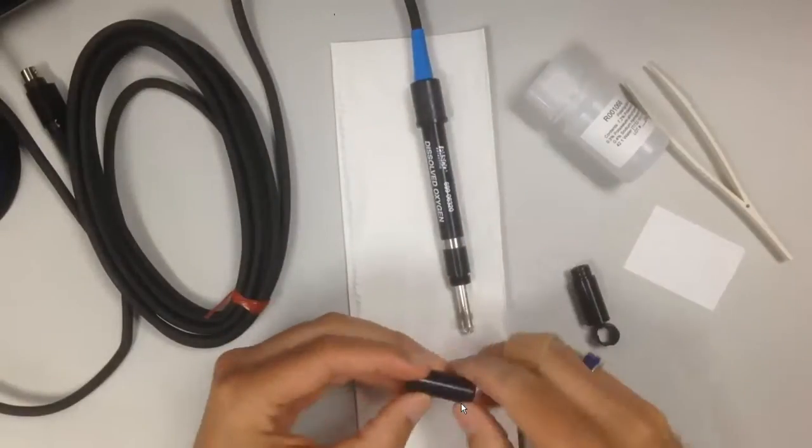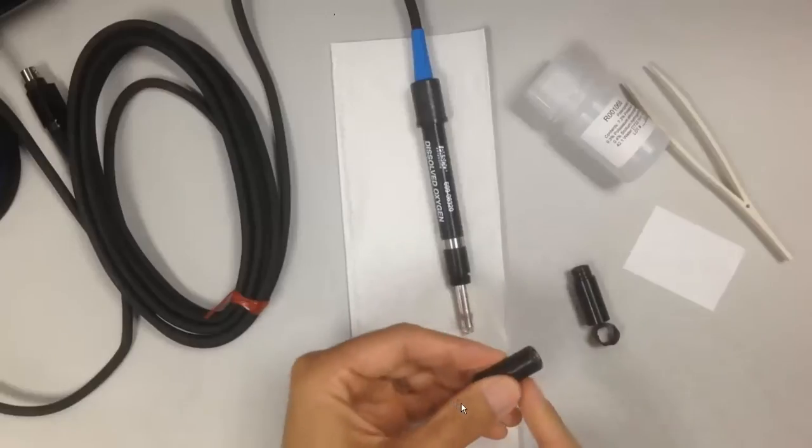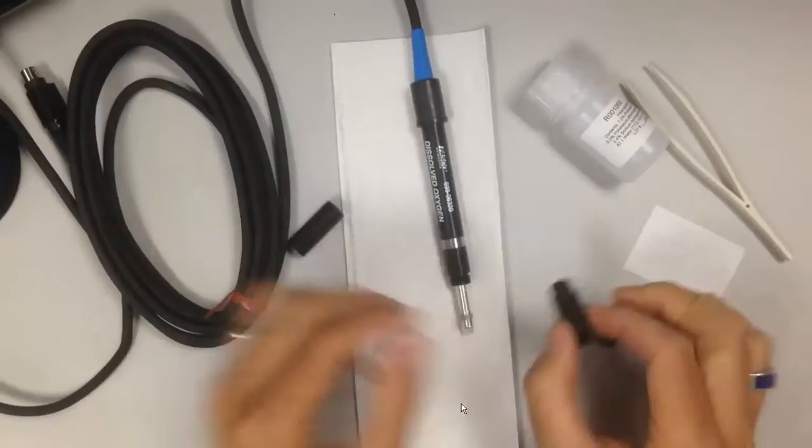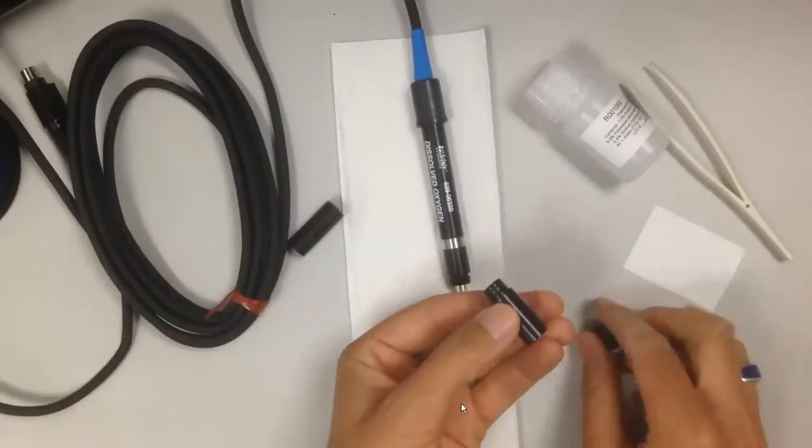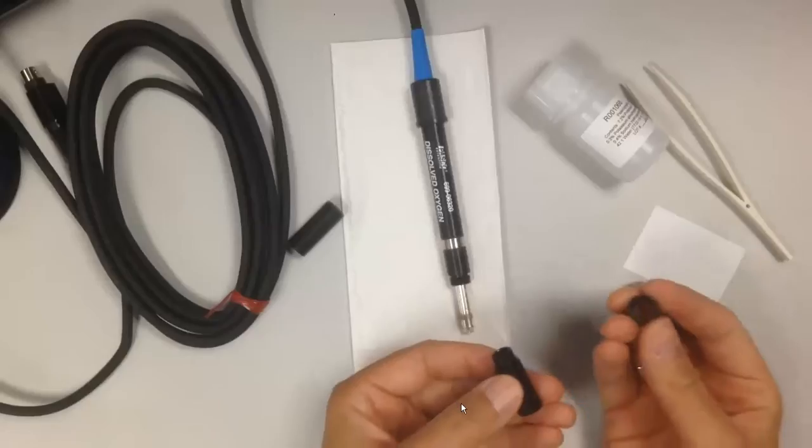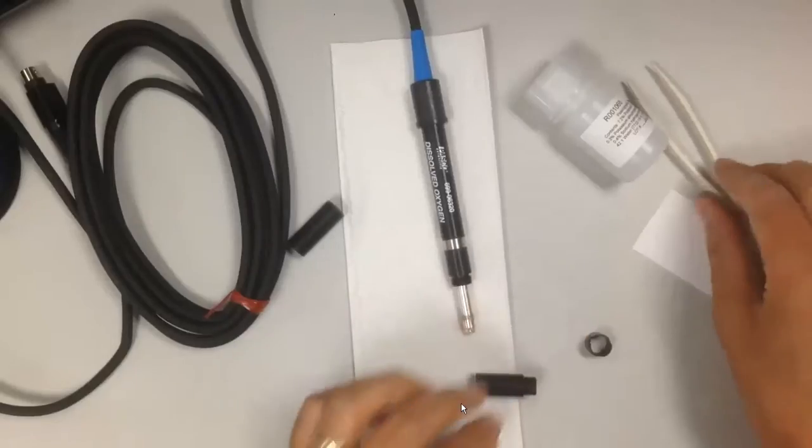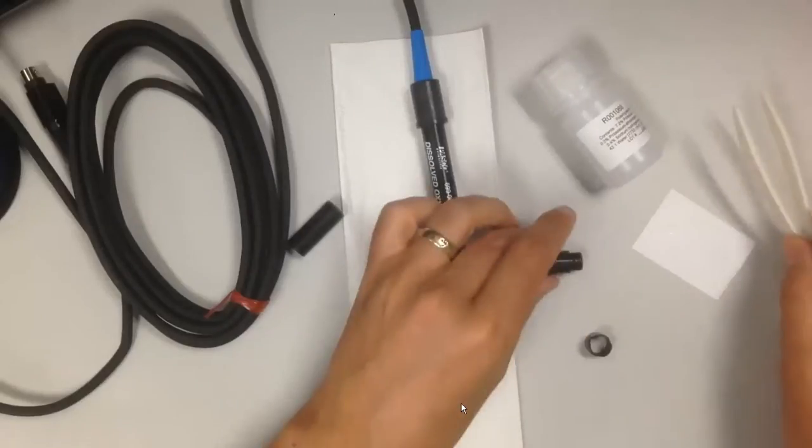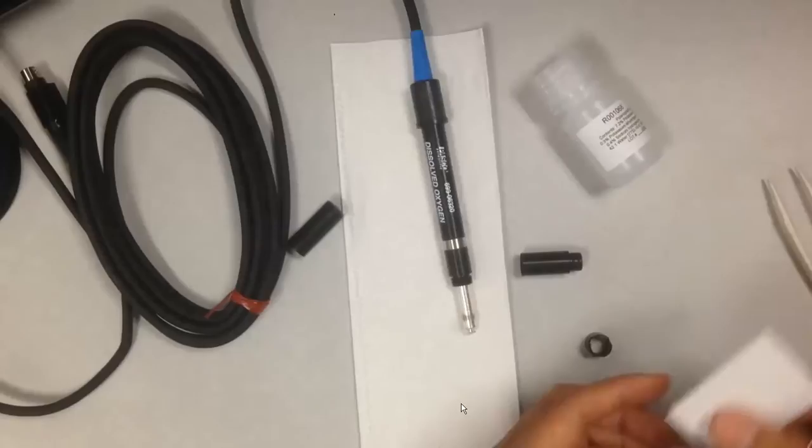This is the original cap. There is no dividing line within it. That's different than the replacement cap that will be used with the removable membranes. This is a two part cap that will screw back on the head of the dissolved oxygen probe.